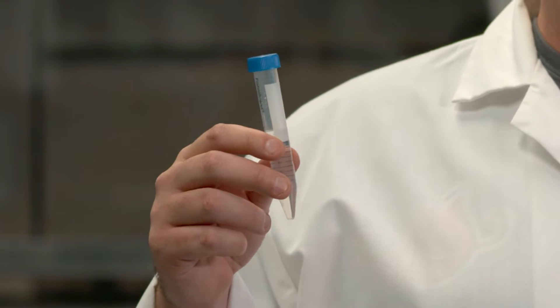This is a similar water sample to those you took at your school. There are two basic types of water samples, flowing and static. A flowing water sample is from a source that is flowing, whereas a static water sample is one from water that's been not moving for a period of time, for example, in the pipes behind the water fountains at your school.